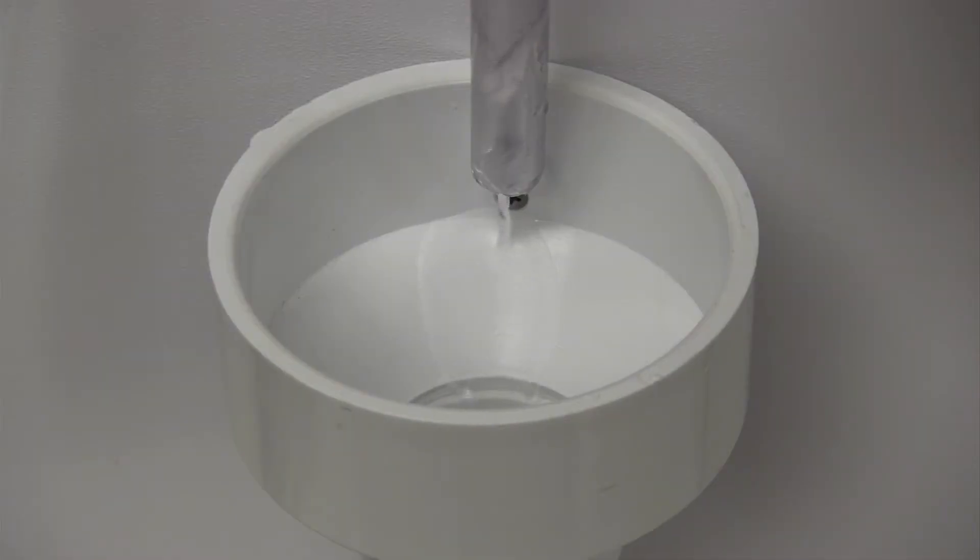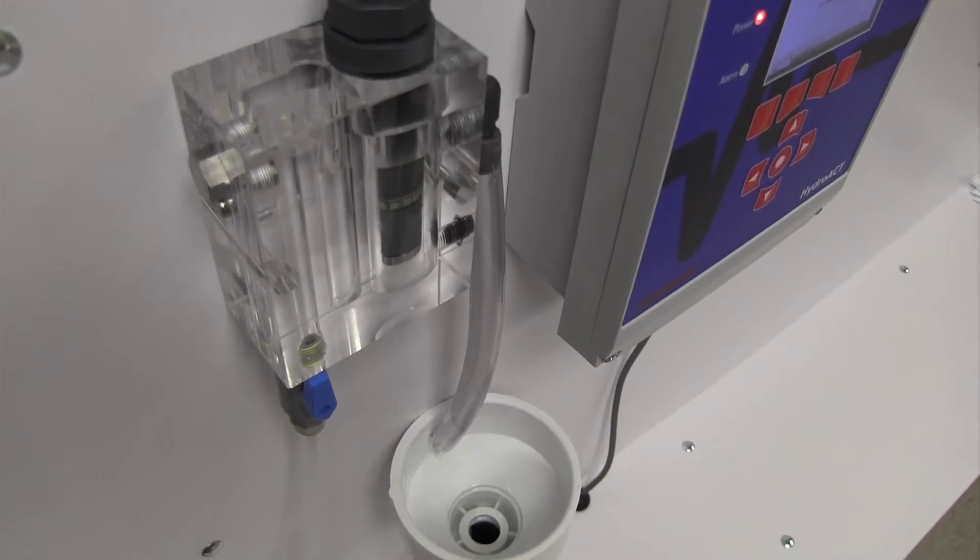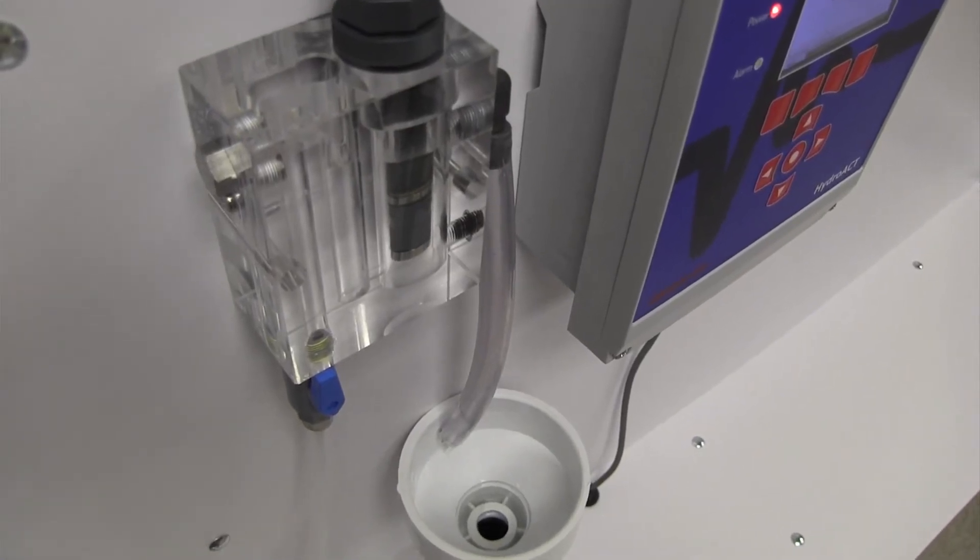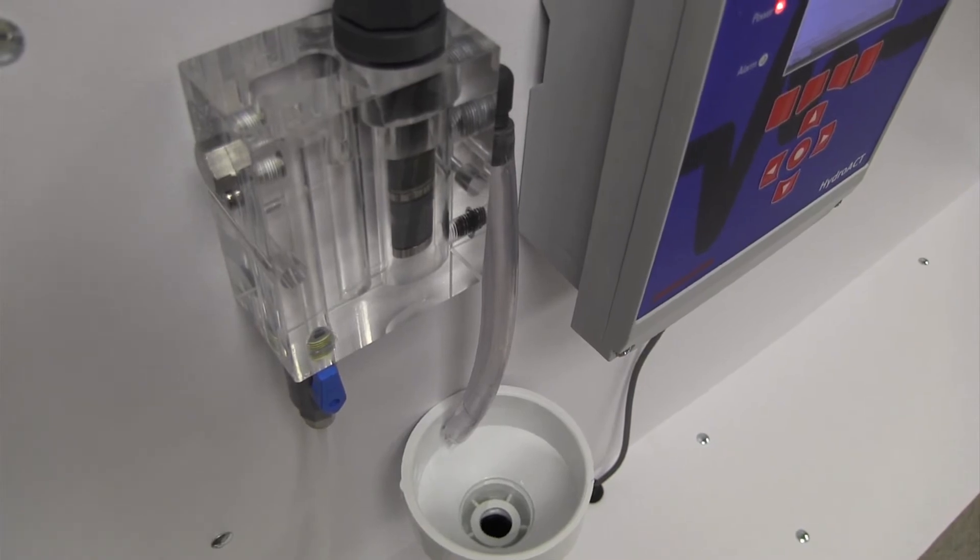The sample outlet should flow directly into an atmospheric drain. The flow cell is vented and will not achieve the proper flow rate if there is any back pressure or flow restriction caused by the drain line.